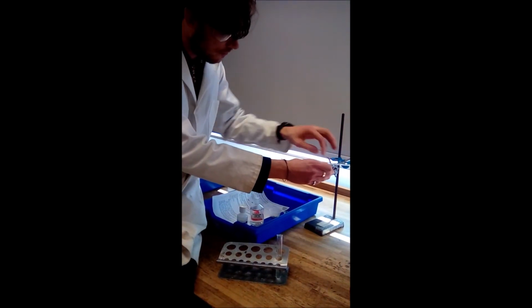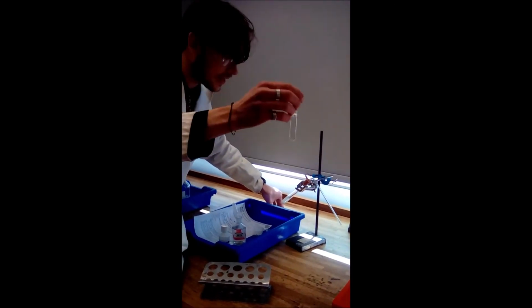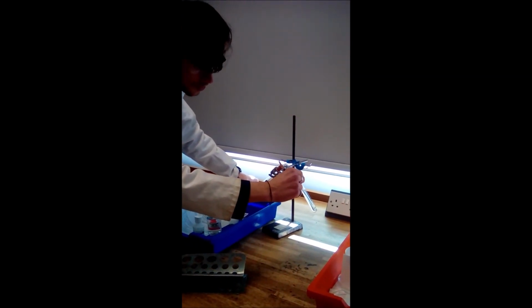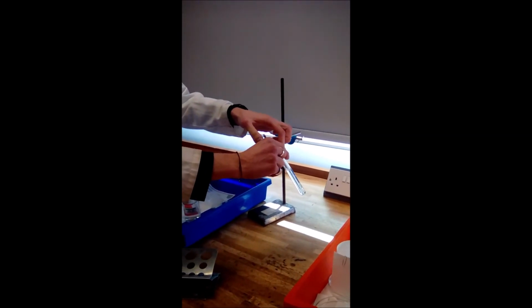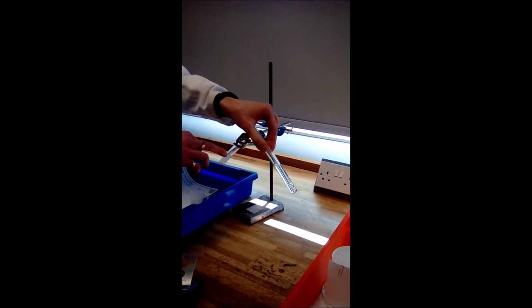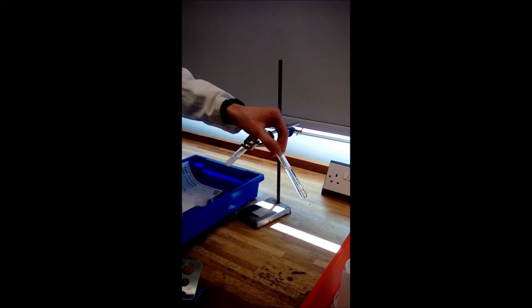And the way to check for that, if I lower them so they actually go in, is what's in here, which as you can see is clear. This is lime water, so we should start to get some bubbling. As the gas is released, it's going to push the air that was already in here through here, and eventually we're going to start getting carbon dioxide coming through here. Carbon dioxide actually turns lime water cloudy.